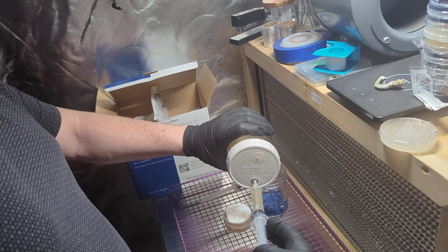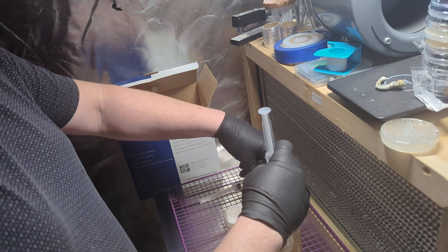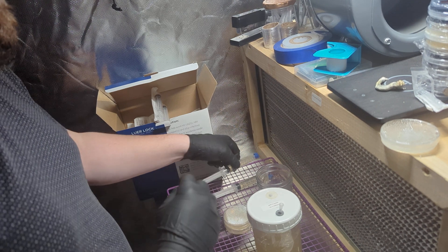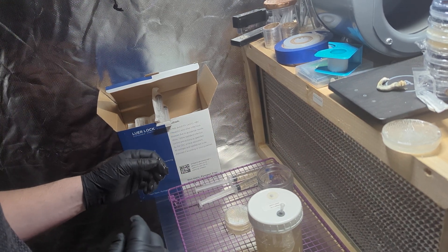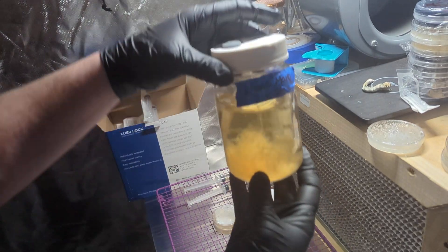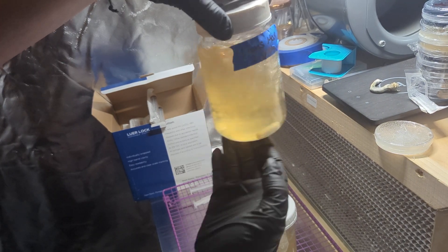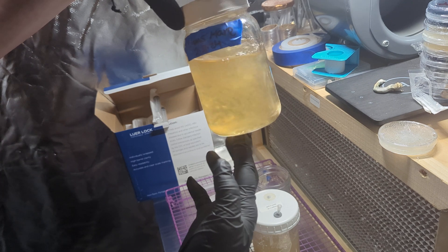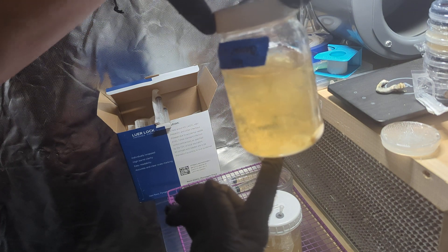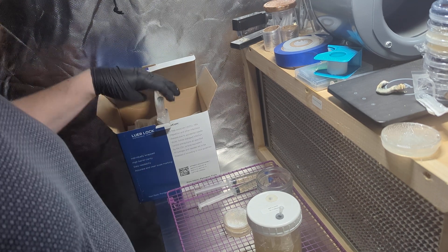I'm going to get 10 of each variety here. The lion's mane is almost ready — this is looking really nice. You can see how clear it is on top and then there's a nice cloud in there. That's halfway to two-thirds, so definitely by Tuesday it'll be ready to go. I mean it's ready now. This stuff is growing really aggressively too — I'm really excited about it. I've got one block fruiting now of that LC.